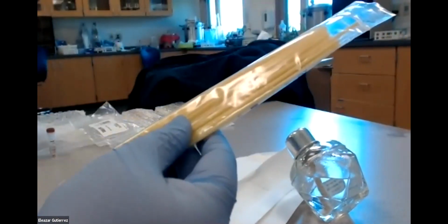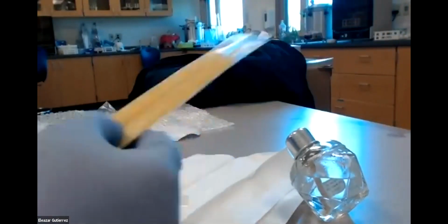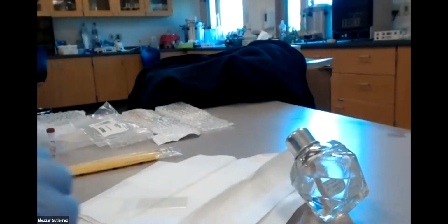Again, we're going to put some organisms on here, and then we're going to add a couple drops of hydrogen peroxide, and if it bubbles, we know that it's catalase positive. So not too bad.